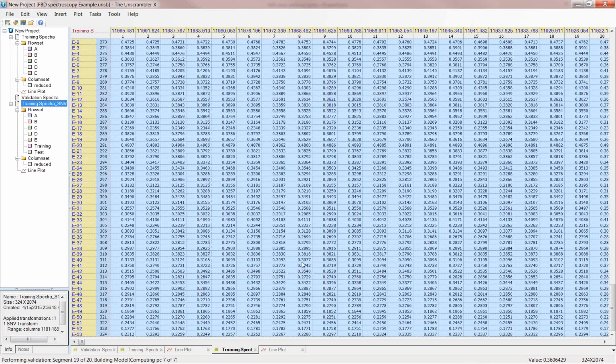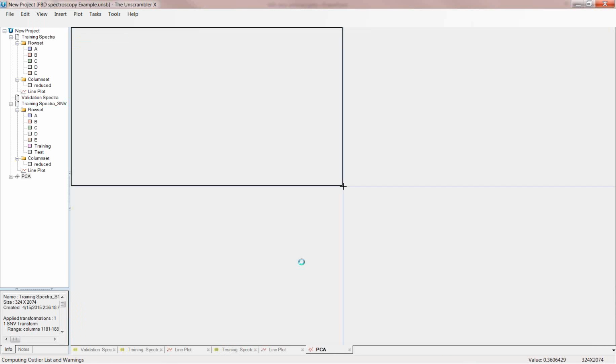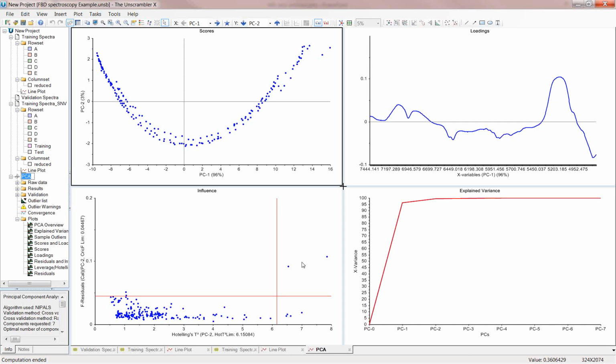I have a question. If I have to look at a specific region of the spectrum for drug content analysis, would I need to do the pretreatment first and then choose that range, or would I take the specific range first and then do the pretreatment?